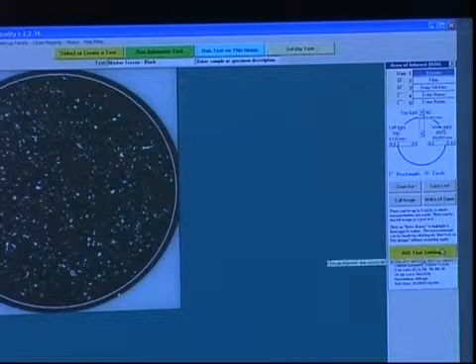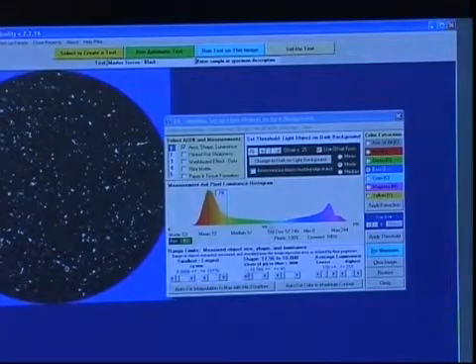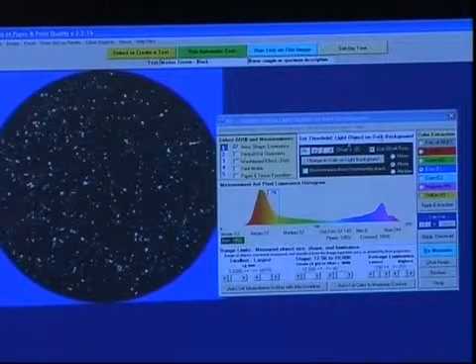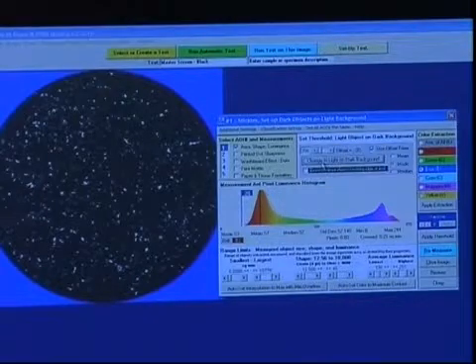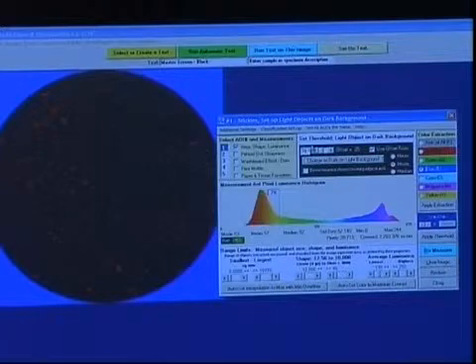So we'll set up the first one, stickies. Here you see that we're now measuring light objects against a dark background. It's very simple to change back and forth between the two, and you can go either way. This happens to be a black hand sheet. So the threshold has to be above the mean instead of below the mean.